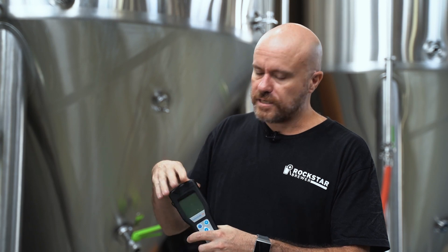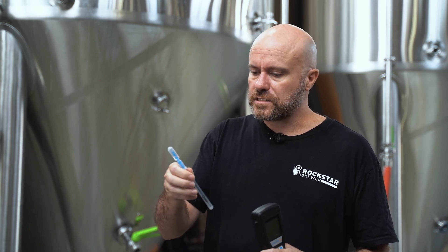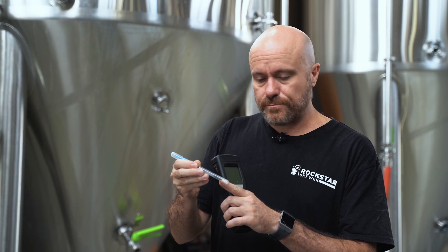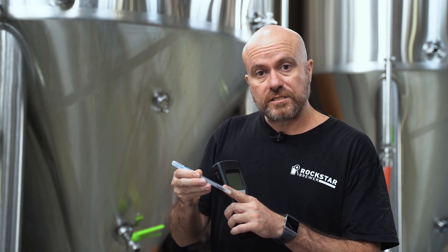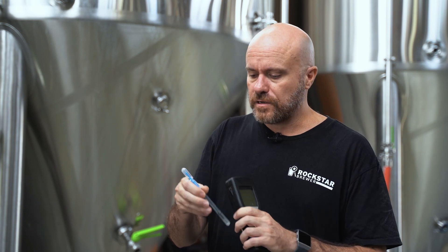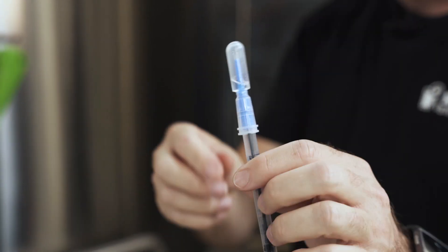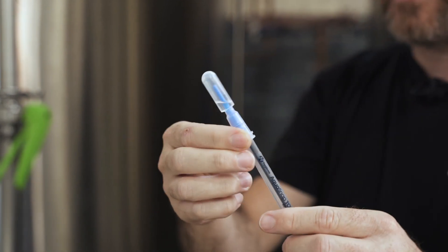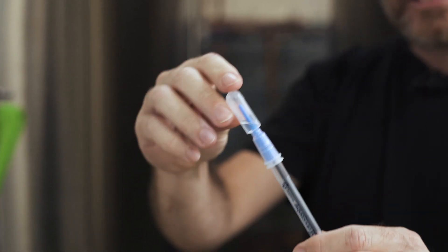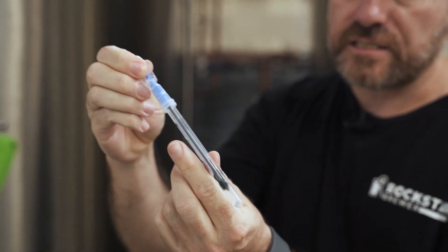What you need when using an ATP meter is your ATP meter and one of these single-use sticks. The stick goes inside the ATP meter, we close the lid, and we can hit a button and take a measurement. These sticks are quite special — down the bottom is the point where we take our sample, where we might dip this into some rinse water or take a swab from inside a tank or a valve. At the top there's some liquid which is actually an enzyme.